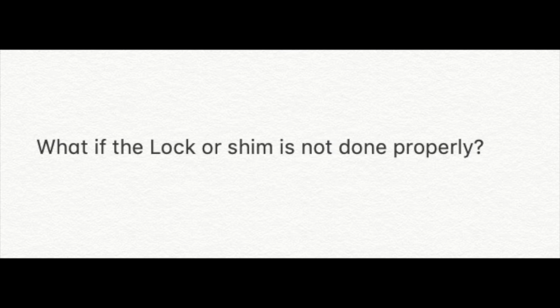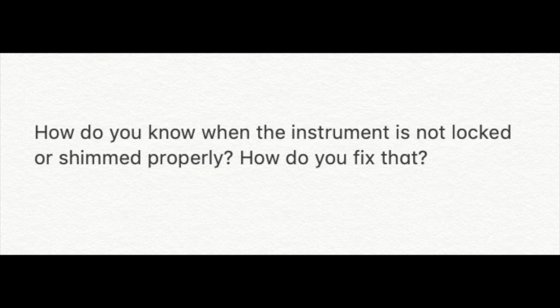It is very fragile. You'll know if the instrument is not locked or shimmed properly when you get your spectra back, or if there's any errors that occur when you're running the experiment. And how you fix that is you'll have to restart with the locking and shimming process. This is an easier thing to do when you're running a proton and it's only a 20-second experiment, but if you're running it overnight, you really want to make sure you have the correct lock and shim before you run it. And you can do that by running a proton first and making sure you're getting a good spectral read before running an overnight.